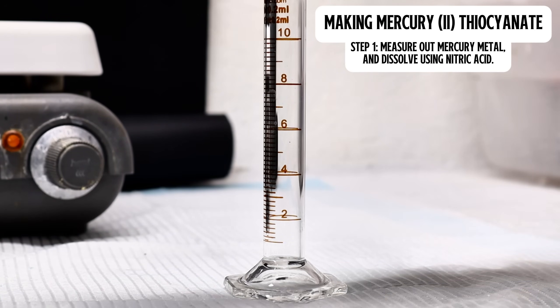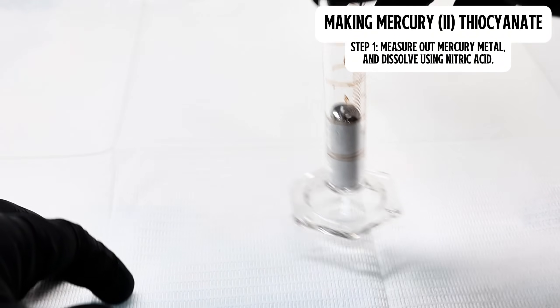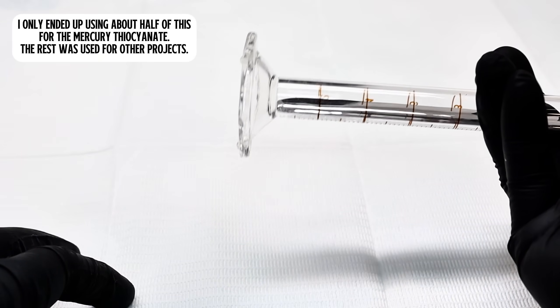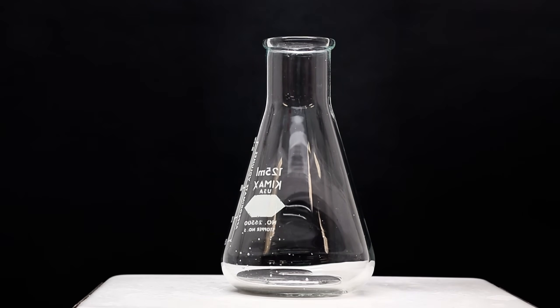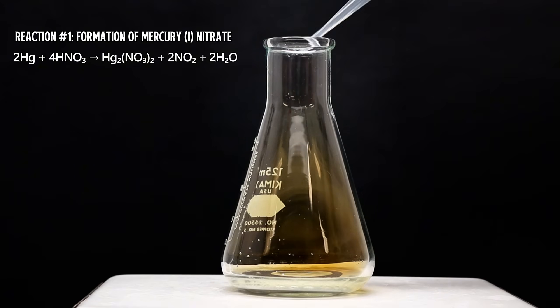To make some mercury thiocyanate, I begin by measuring out 4 milliliters of elemental mercury. This is around 54 grams of mercury, and way more than I intend to use here, but I decided, given how scary this stuff is, that I'd dissolve a lot all at once so I could use it for multiple projects. I next pour the mercury into an Erlenmeyer flask along with some nitric acid. The nitric acid will immediately begin to dissolve the mercury, forming scary red NO₂ gas.